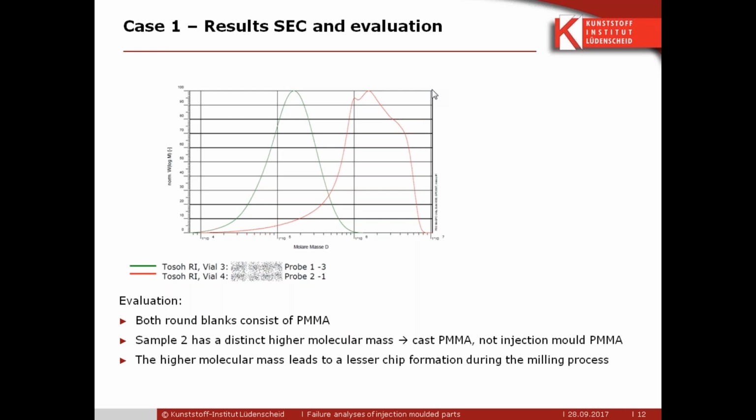Not so big differences in the material, but very big differences in the production process, because we see differences in the first heating run, but not in the second heating run. So that helps us more to find the root cause, but it's not the final root cause that we see. So we performed a third method.